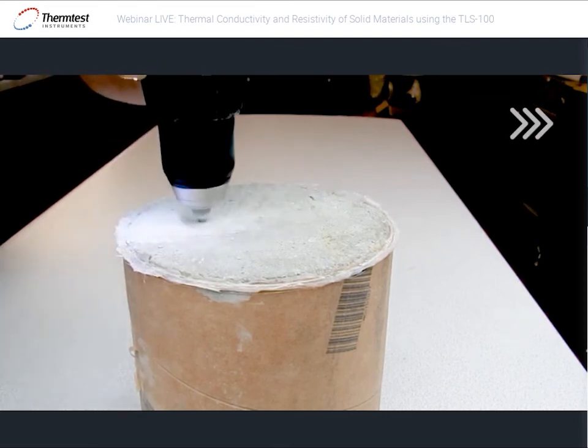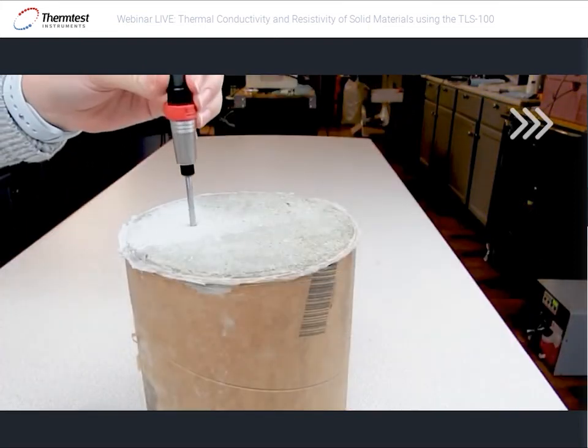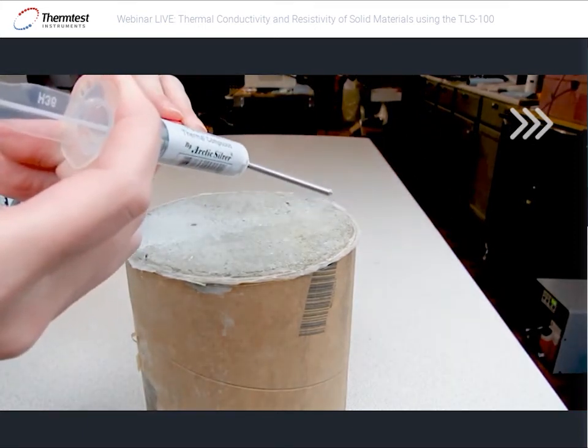With the hole ready, get rid of the dust and drill it out carefully, because you don't want the dust sitting in the hole and blocking the needle once you want to get it inside. Try to put your needle in dry first to make sure it fits. Otherwise you have to get back to your drill.